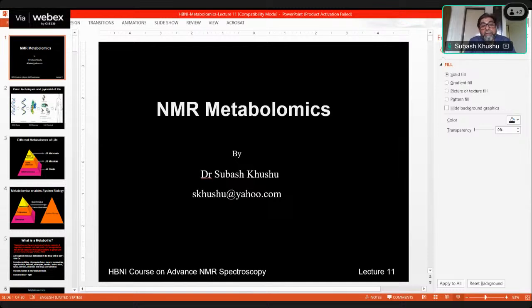Then molecular dynamics studies are possible by T1, T2 relaxation times and diffusion coefficient measurements, which is not possible using mass spectroscopy. Analysis of tissue samples is possible by using magic angle spinning NMR, which is not possible by MS. So there are several advantages when you do NMR metabolomics compared to MS, and in most cases it is much cheaper than the MS technique.